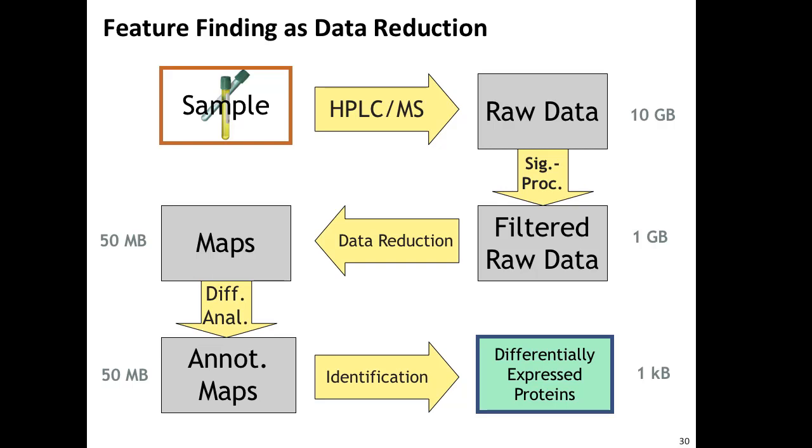Why is that? Biological systems trying to stay in homeostasis. Yeah, we're dealing with homeostasis. There's more variance, yeah, but you should not try and compare a urinary metabolome with a blood metabolome. These are different things. You can try to do it, but it's not going to work. So it needs to be comparable, and we will actually use that later on in normalization, because there are some issues there as well.